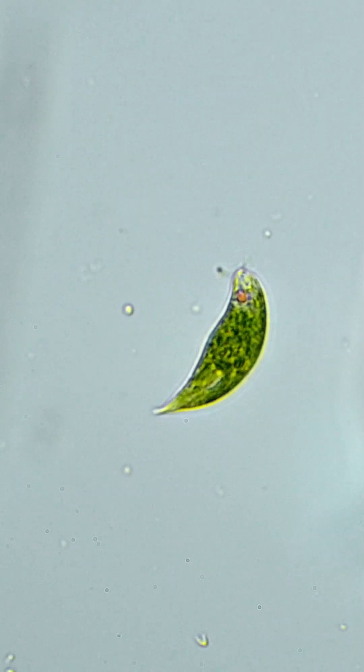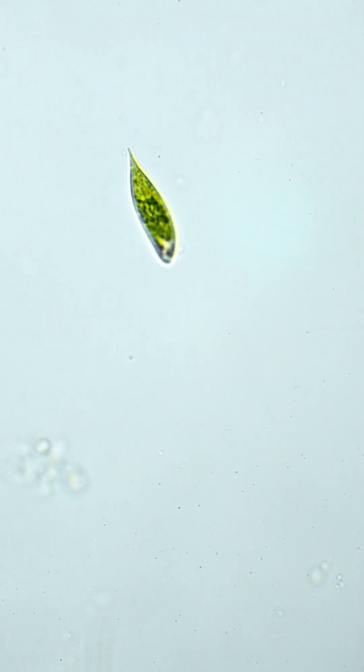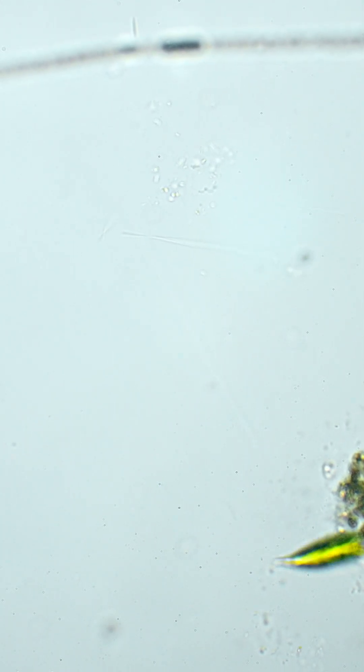Don't underestimate its single flagellum. It allows Euglena to swim freely in water, like a tiny green sprite dancing around.